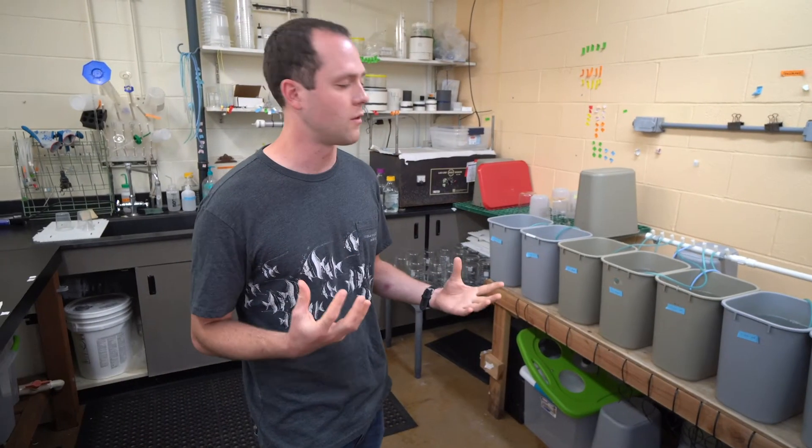The advantage of this is the larvae are quite a bit happier than they are in these 1-liter beakers. You get a higher number of larvae per bucket.